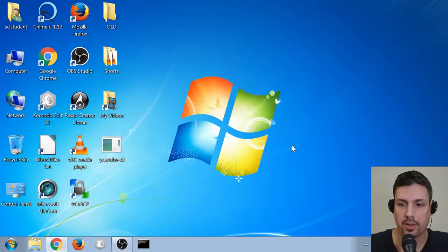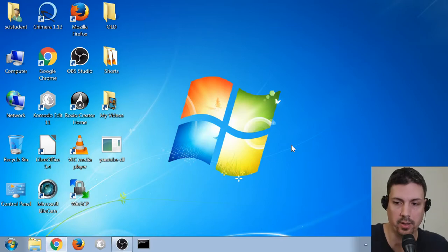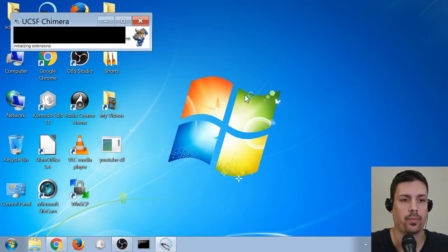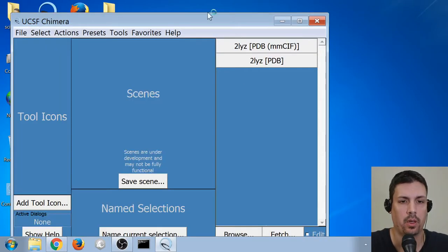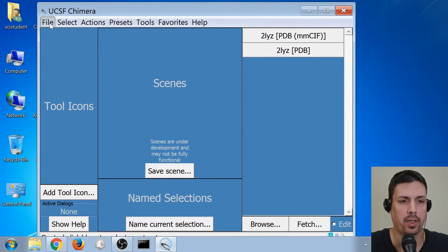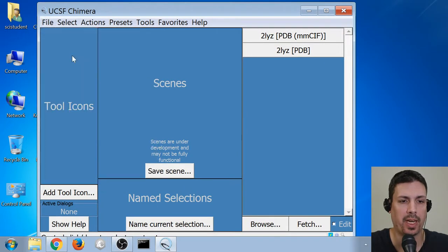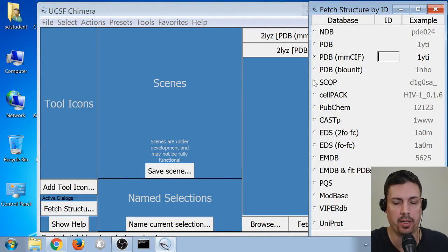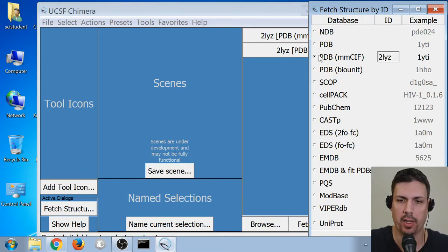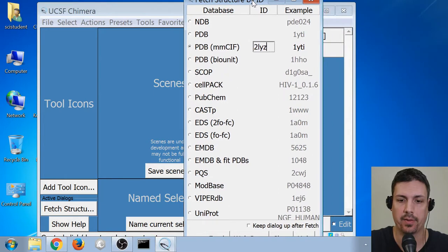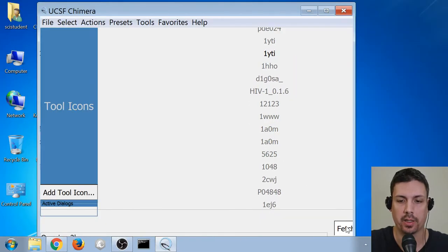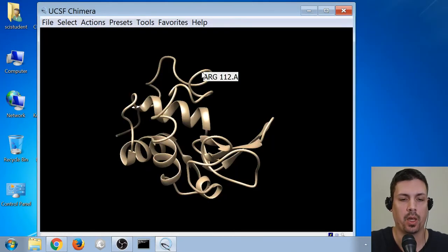Alright, so after the installation of the program, let's go ahead and open it with our new icon it created on the desktop. So I'm going to do a quick preview of what the assignment is for next week. Basically, I'm going to give you an ID. I'm going to use 2LYZ today, but you're going to get a different ID. And I would download PDBMCIF. Sorry, I've made my window kind of crazy. Click on the Fetch button, and now it'll open up a structure.